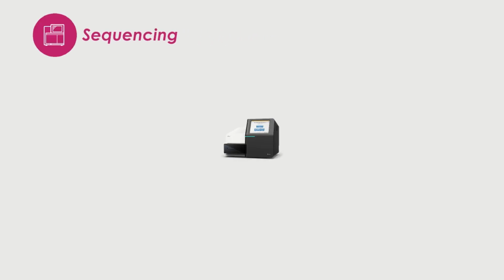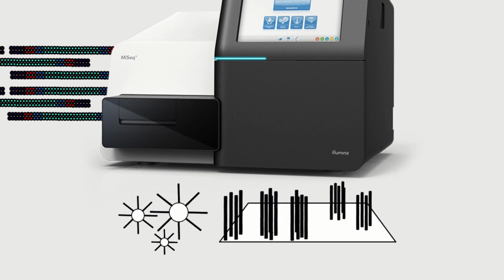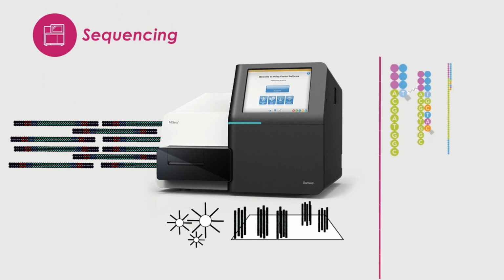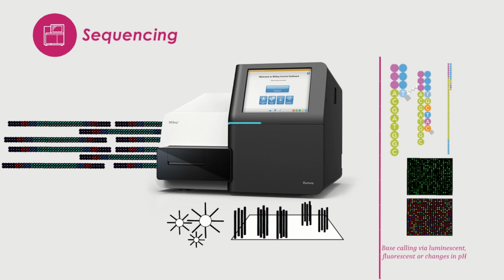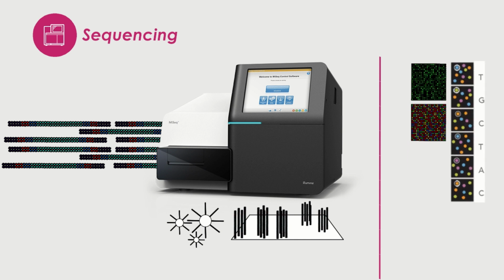Sequencing. The DNA with adapters is first amplified into clones or clusters, followed by a series of chemical reactions that produce a change in pH, luminescence, or fluorescence. Signals are captured by cameras and computers, which are then translated into base calls.